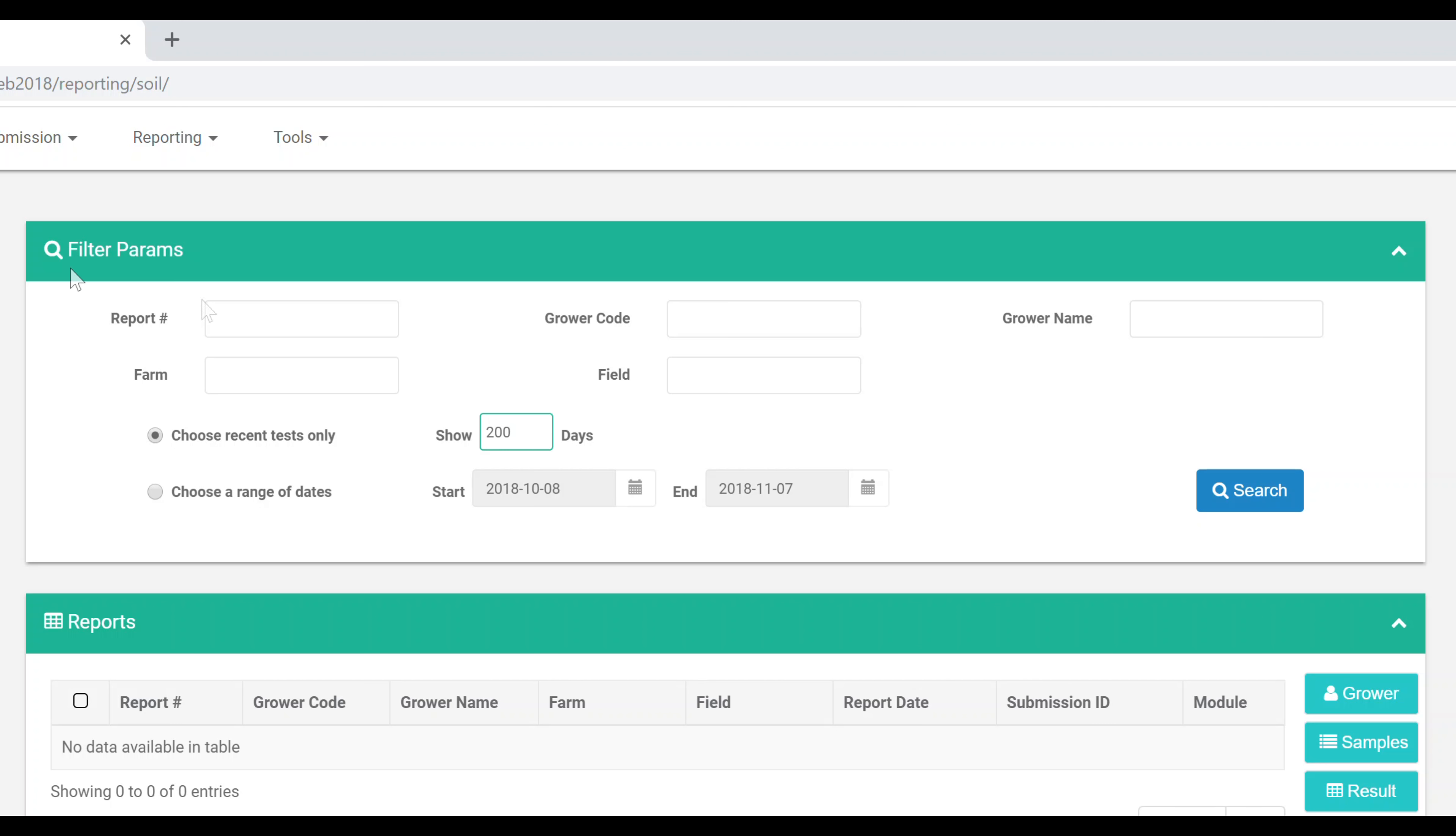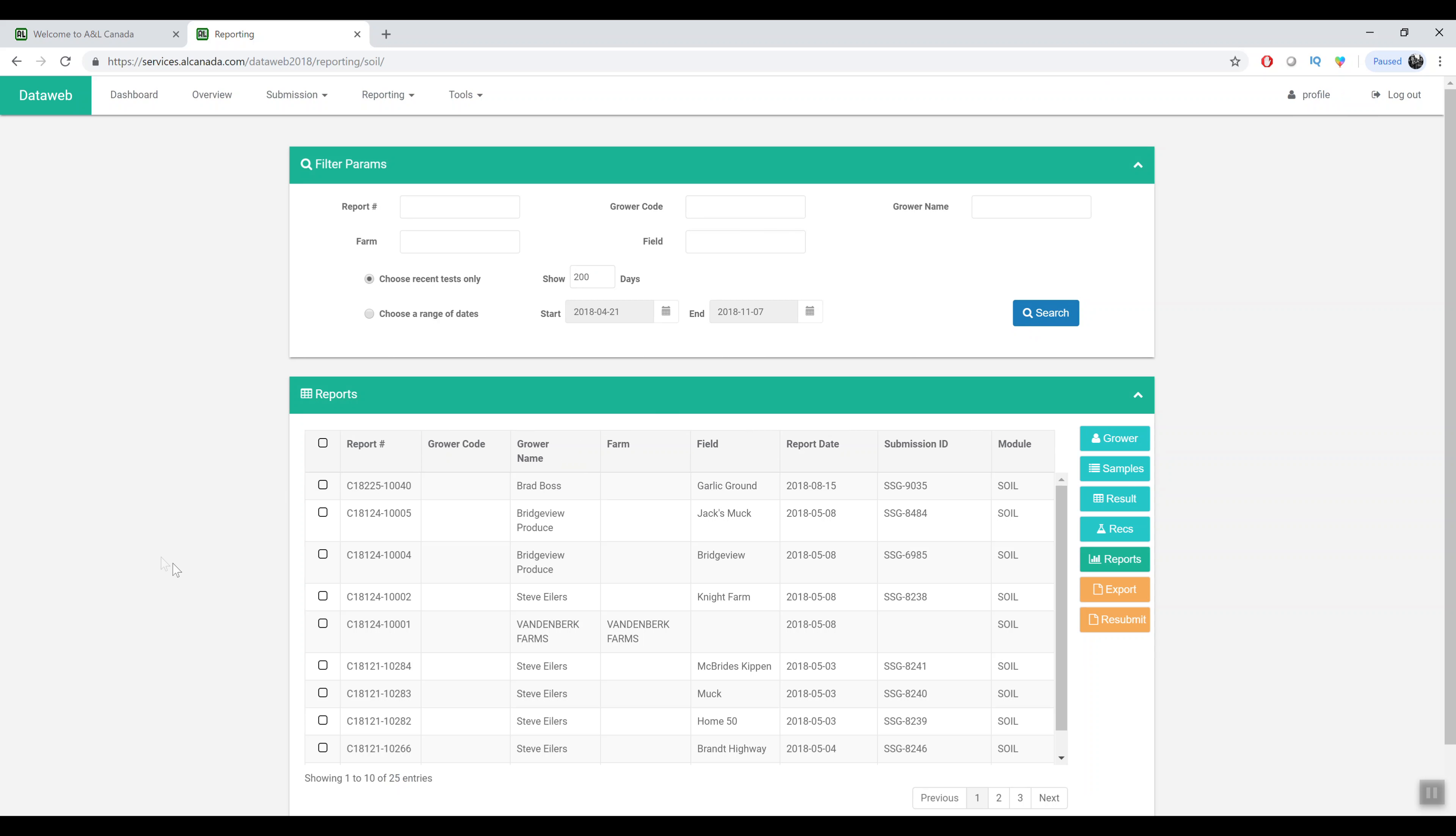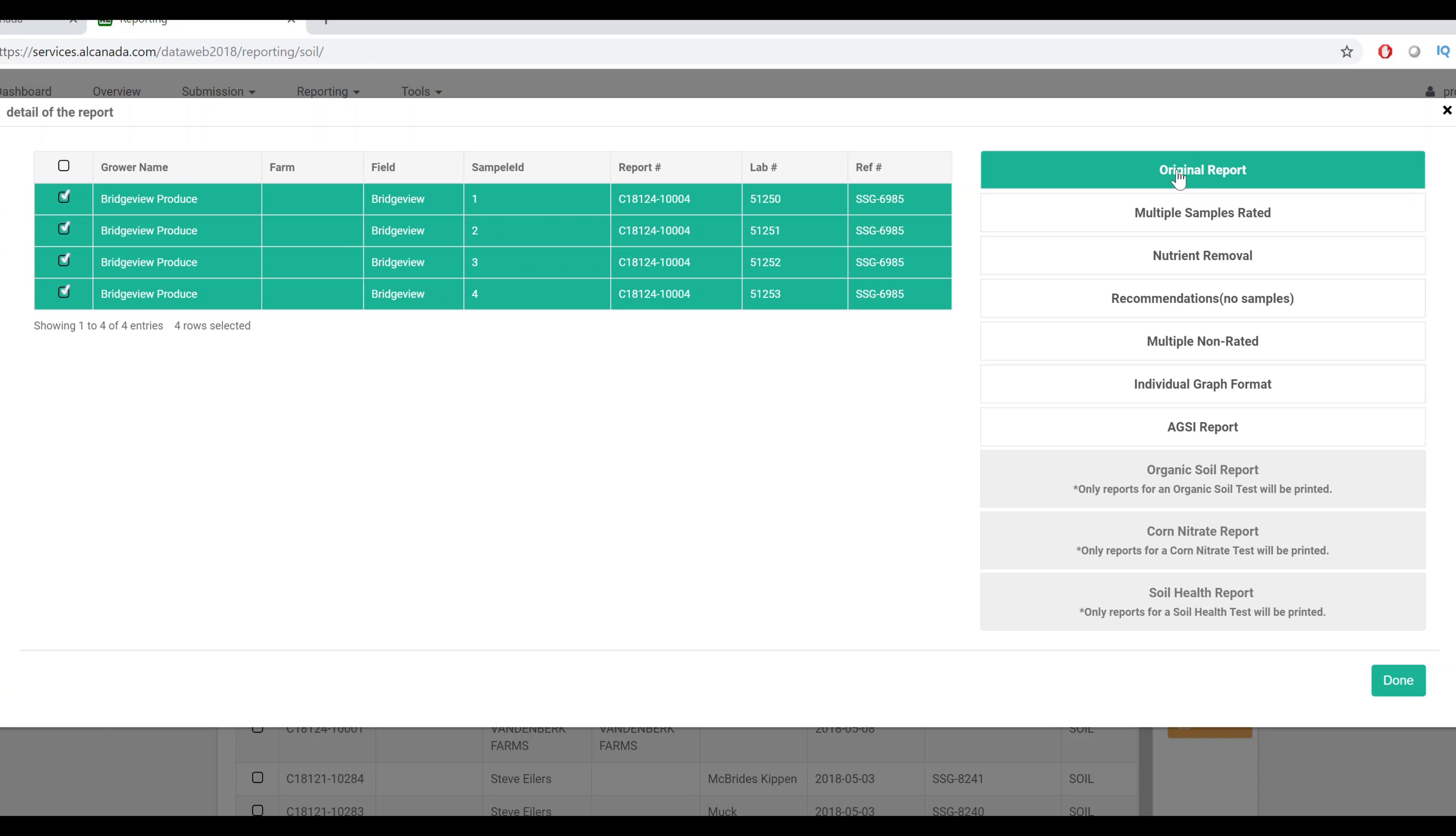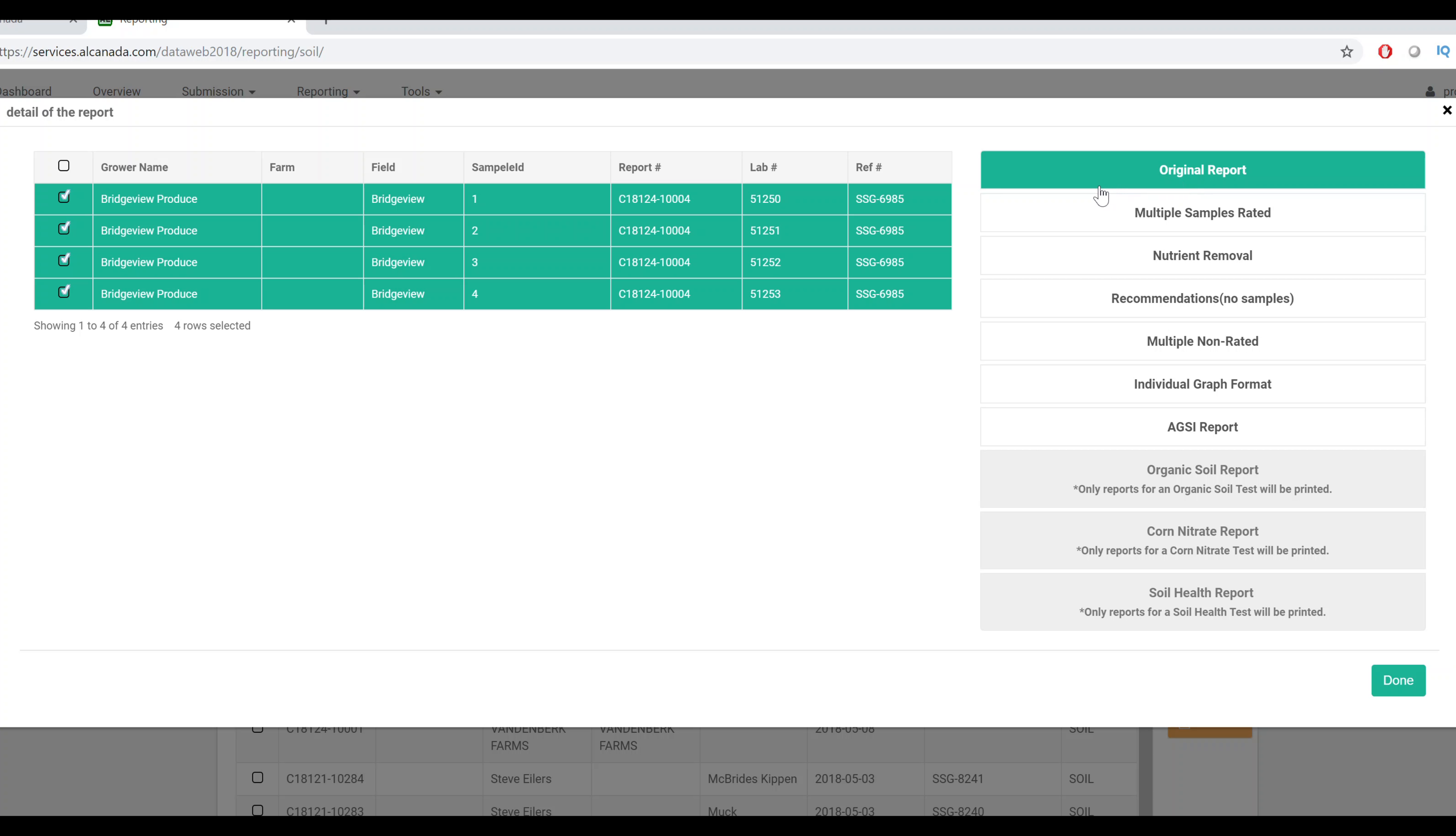The new feature that we've added is the ability to print the original ANL report. So if you have a custom report with the lab with your logo and layout you will now see that on the DataWeb. You can make changes to recommendations, grower name, that sort of thing. It's still printed on the original ANL report.